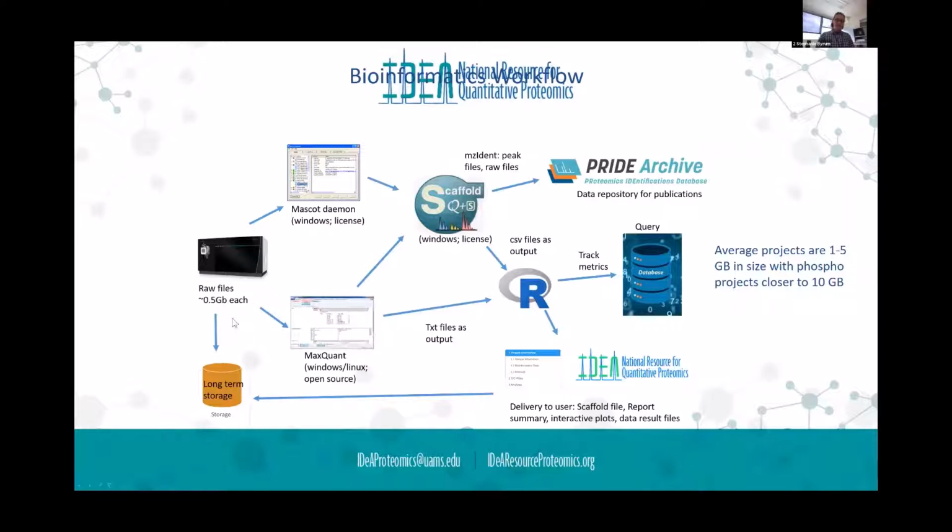So we take our raw data. We get either a Mascot or MaxQuant database search. Then we can dump those results into Scaffold. Scaffold is a nice viewer software to look at more details of the data. This is really important for publications. I found that it's easier to submit data to the PRIDE repository by using the Scaffold tool. Scaffold will export the mzIdentML files that are necessary for a PRIDE submission, and it makes that process a lot smoother. So I use that a lot for PRIDE.